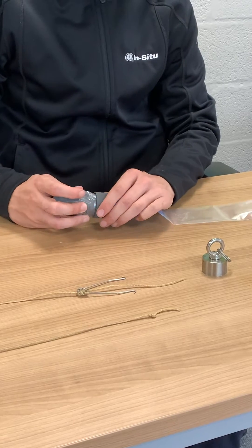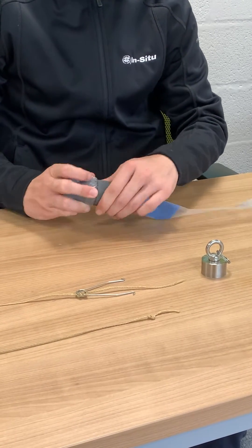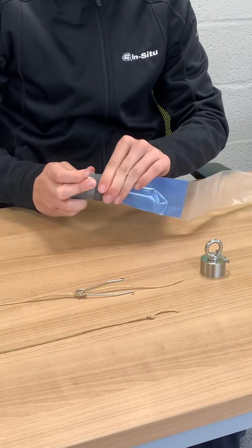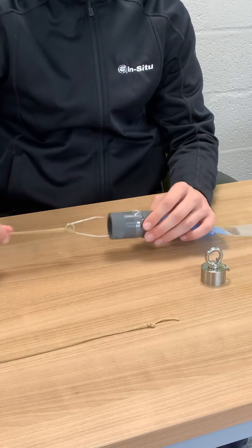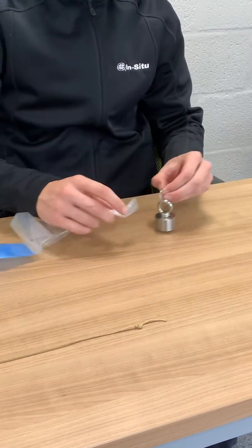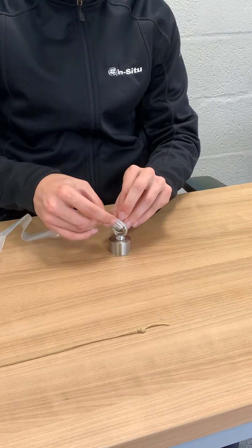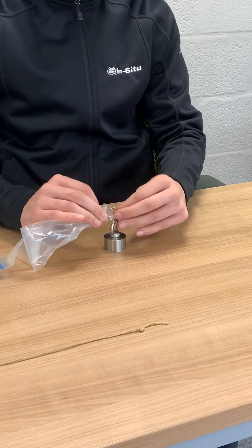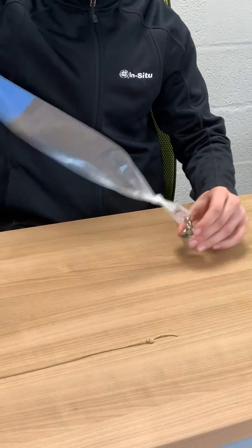To suspend you'll need a reusable PVC top collar with a spring clip, and also a weight at the bottom which needs to be appropriate to the depth you want to take your sample from. This is generally 175g for shallower applications, right up to 525g for deeper depths.